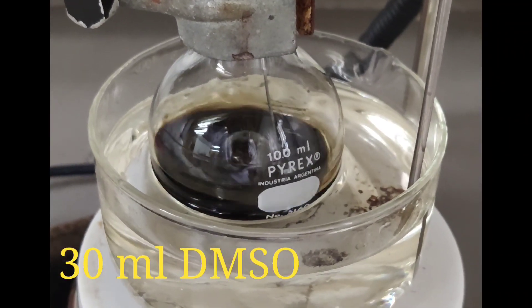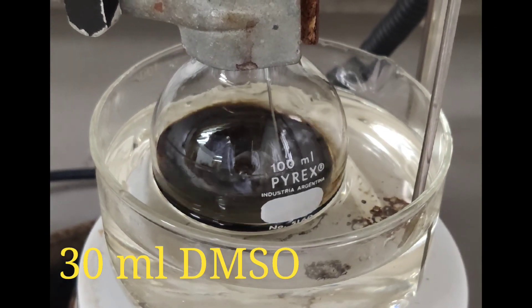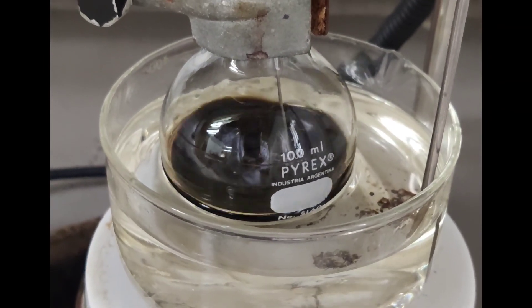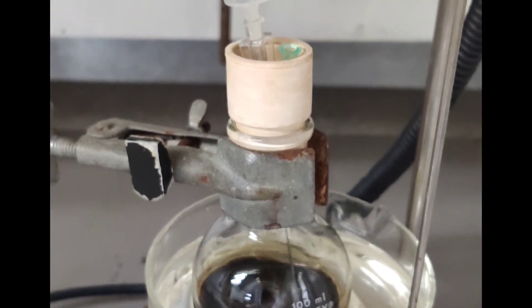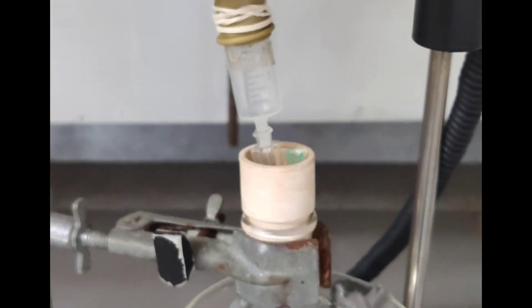We pour the corrole into 30 ml of dimethyl sulfoxide in a round bottom flask and bubble it with nitrogen for about 10 minutes. Then we pour the cobalt acetate and heat up to 80 degrees celsius.